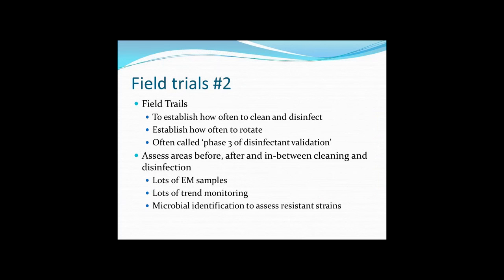So field trials help us to establish how often to clean and disinfect and how often to rotate. It's important to assess areas before we apply the cleaning and disinfection process, after, and also if we're leaving areas for a few days, to do some monitoring in between. So unfortunately, there's no getting around it. It's quite a laborious activity. It generates hundreds of environmental monitoring samples. There's need for lots of trending, lots of identification to make sure there are no resistant strains, but it is important to do.